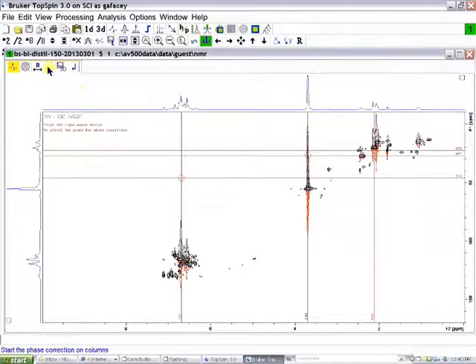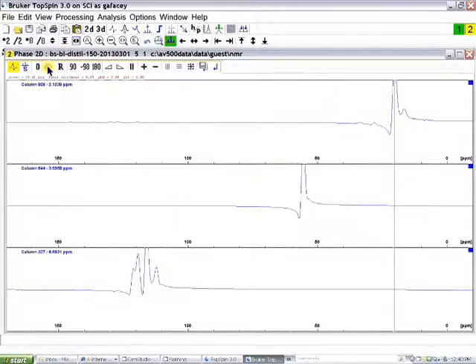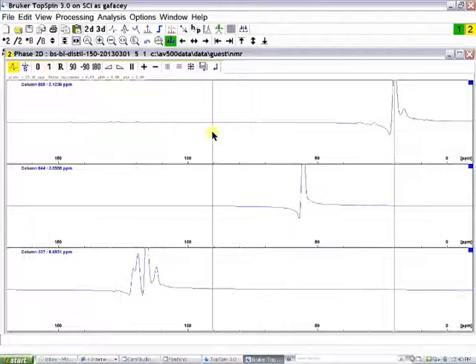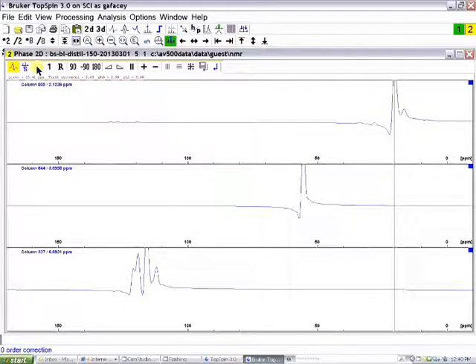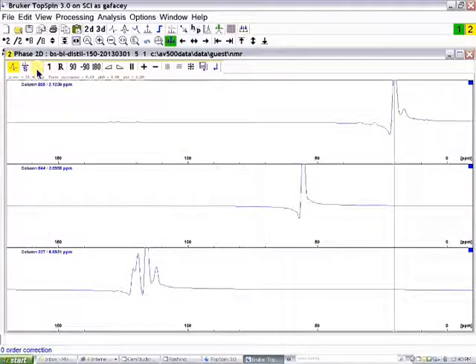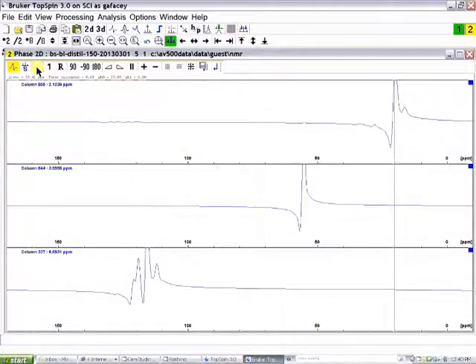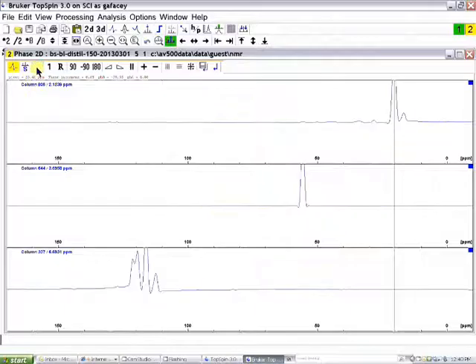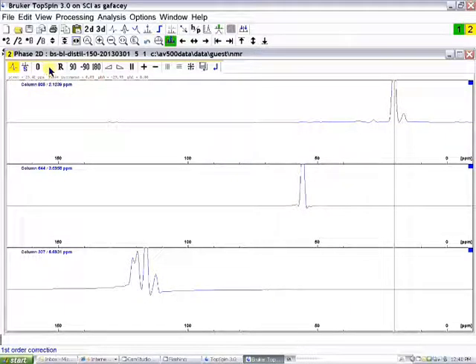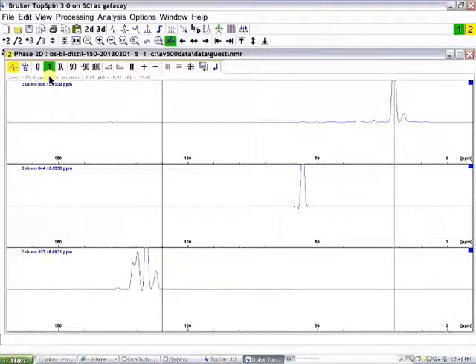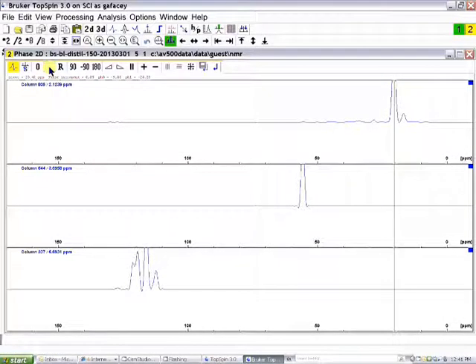And then click on the C icon with the vertical arrows, which is for columns. Now you can see the three columns that we've selected. Again, the red line on the top spectrum is on the largest signal. I'll go to the zero order phasing icon and I'll phase that column. Then I will go to the first order phasing icon and phase the spectrum on the bottom so that it's in phase.